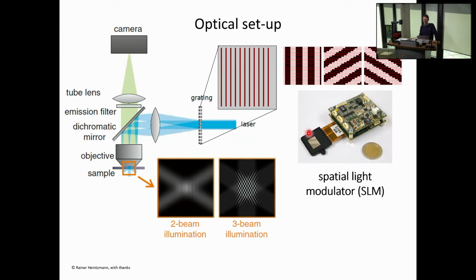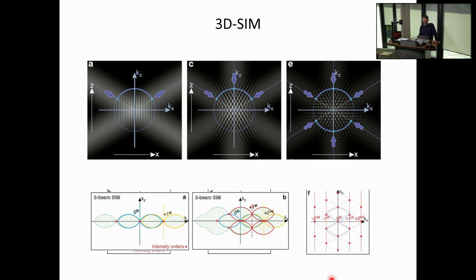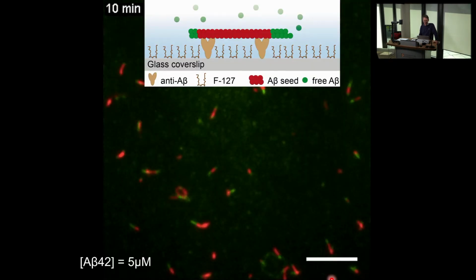So you see, you just changed the patterns, where they're reflective and non-reflective, on these systems. Okay, I'm not talking about 3D SIM. Ignore that. That's not part of what I want to do. There are variants of this technique to gain more and more resolution, and these are advanced, so you can ignore that slide I just showed. It's not part of the examination.